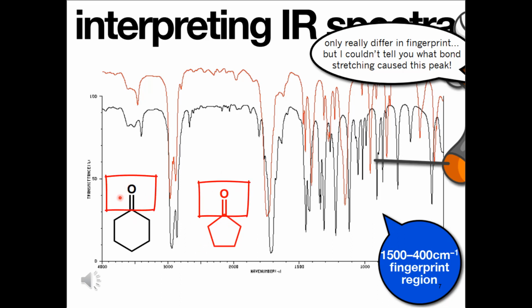Now, on its own, it's very limited in its scope and is often used in conjunction with other techniques that provide a more complete picture of the molecular structure. Nonetheless, it can be useful for monitoring reactions or as part of the characterization strategy for an unknown molecule.